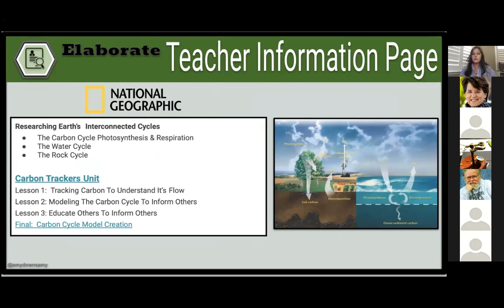So everything here is really launched from the idea of how photosynthesis happens inside a leaf, just from taking that leaf and capturing some images of the stomata and how that part works.